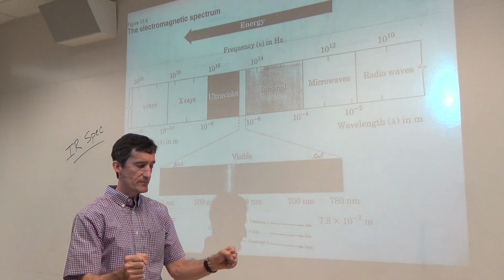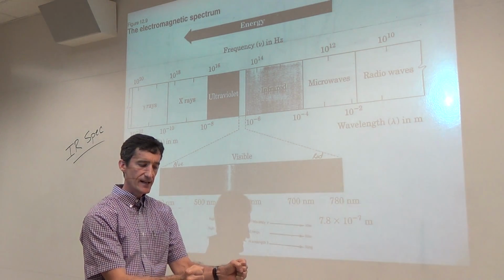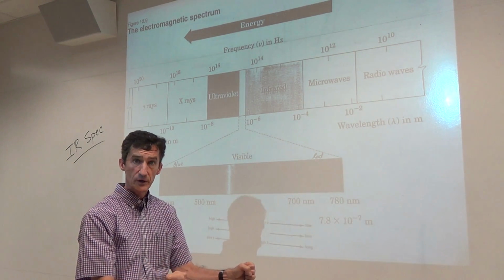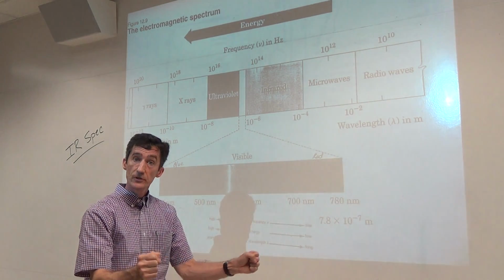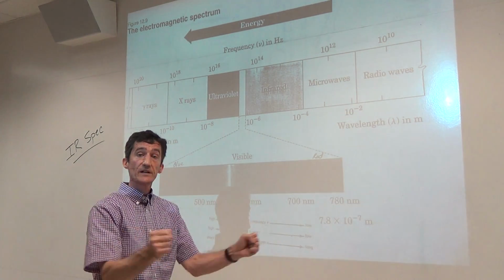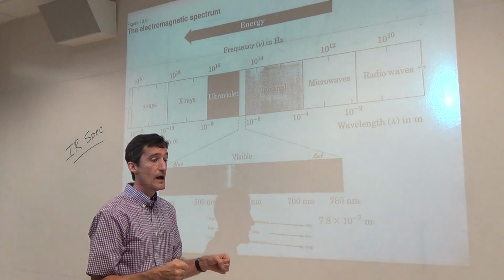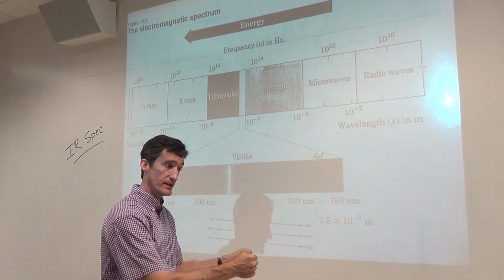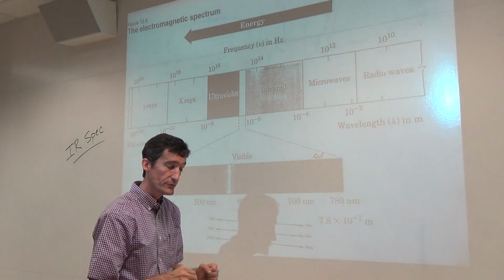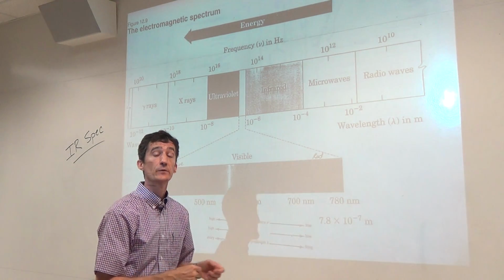Any bond length quoted in a table is just a static number. That bond is really stretching, which is a general type of vibration. But that stretch occurs at a certain frequency. It can stretch slowly, or the stretch can be faster. That's two different frequencies. A molecule can have one bond stretching slowly, and another bond stretching faster. It turns out that that frequency correlates with IR frequency.